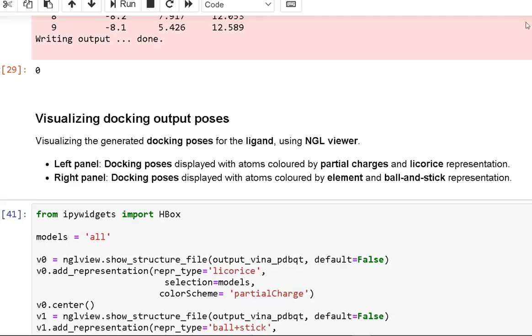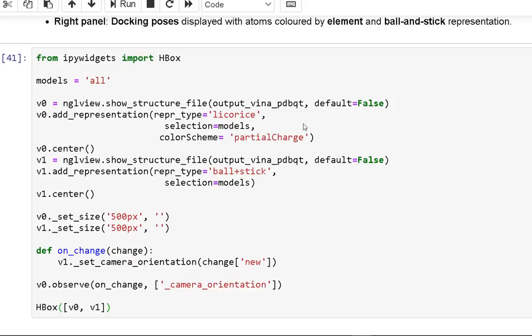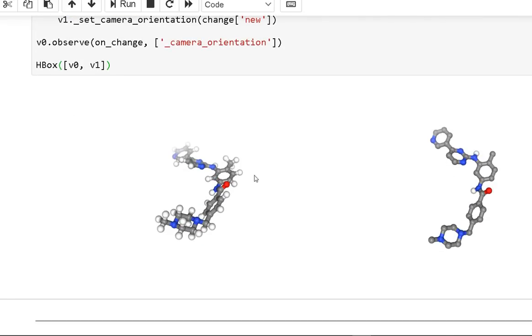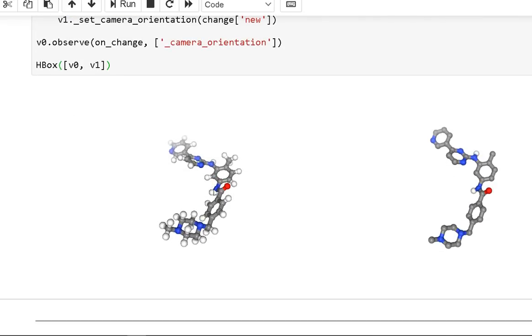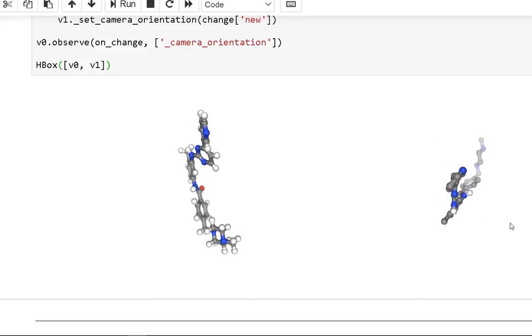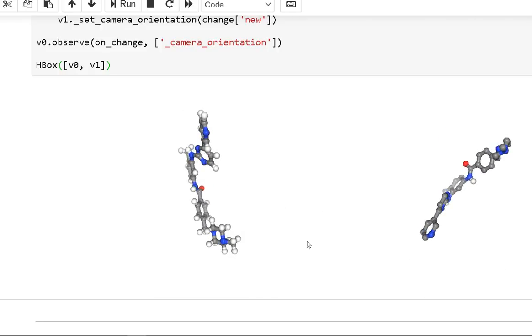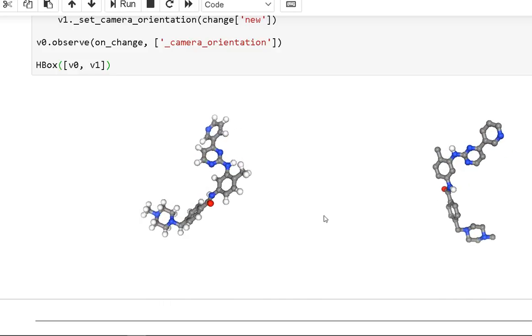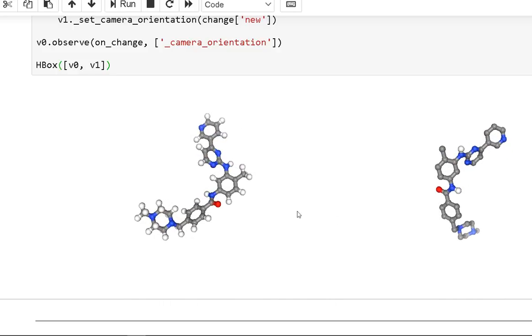Using the NGL viewer, we visualize the drug that will be docked to the target protein. The PDB-formatted file with all hydrogen atoms is shown on the left panel. The PDBQT-formatted file uses a united atom model where only polar hydrogens are placed in the structure to correctly type heavy atoms as hydrogen bond donors.